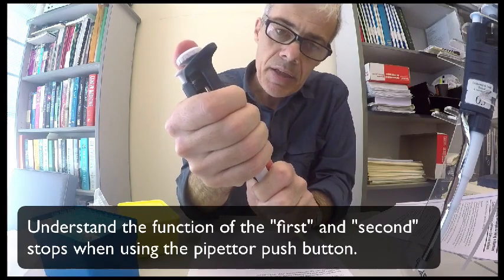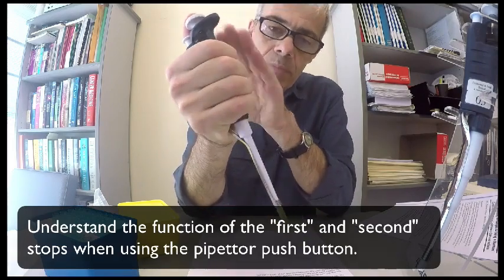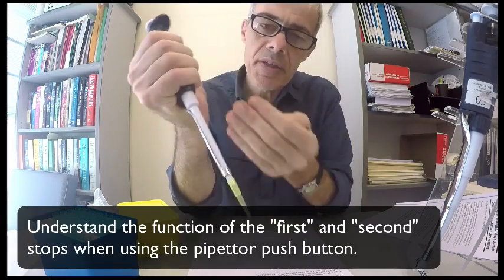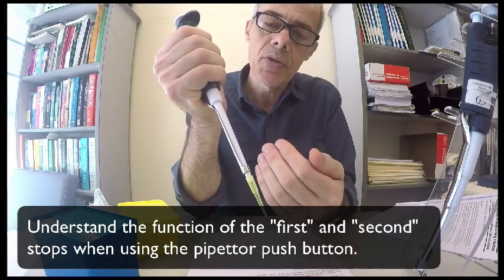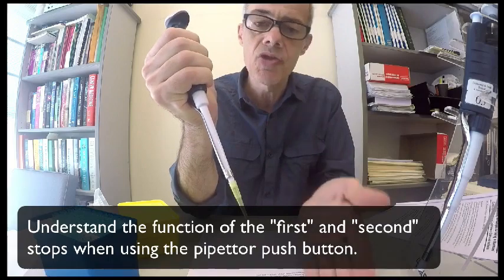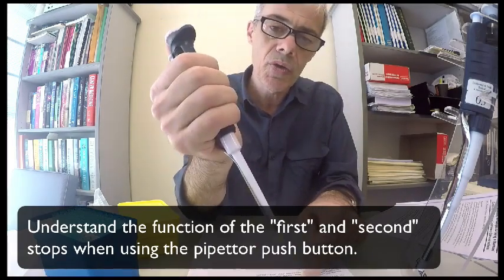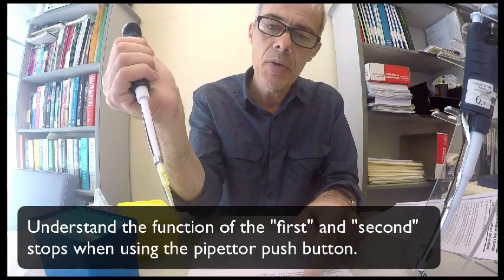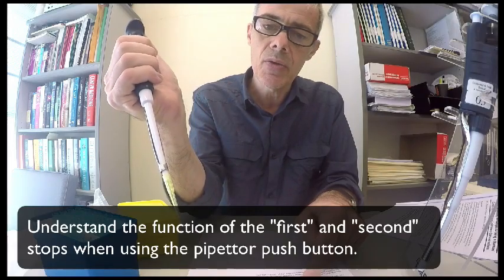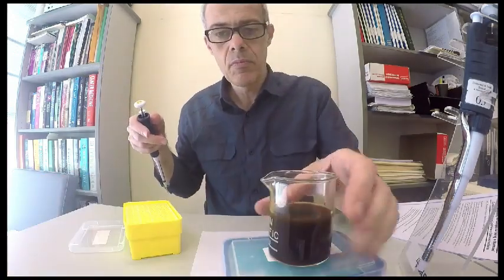The second position is not calibrated, it's just an extra bit of push that dispenses a little bit more air out to expel the solution from the tip. So you don't use that when you're drawing the solution up. You only use the calibrated position to draw the solution up, and then you dispense all the way down. So let's have a look.